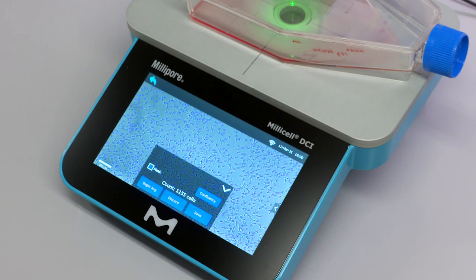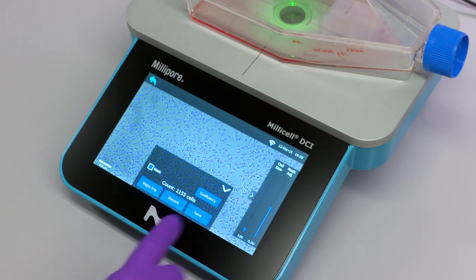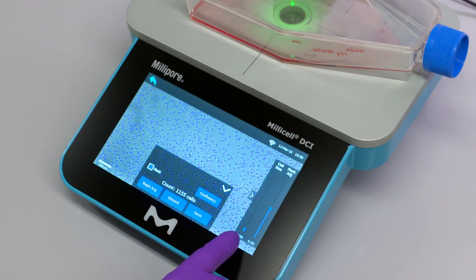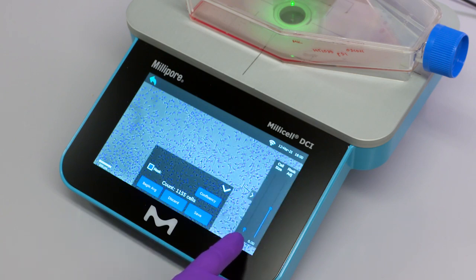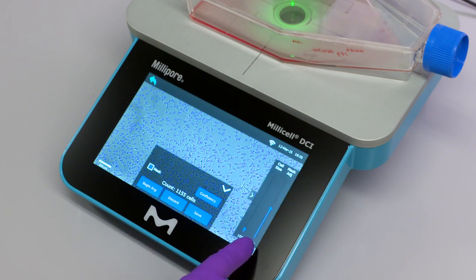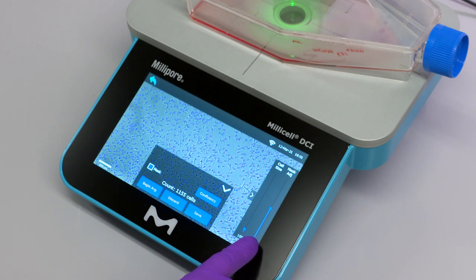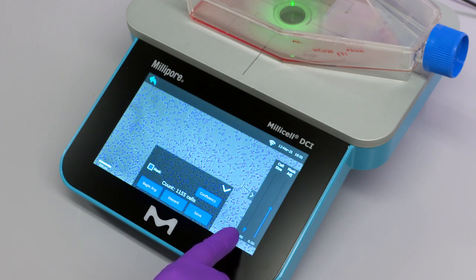The confluency and cell count masks can be adjusted using the two slide bars on the right. The mask adjust slide bar can be used to adjust the confluency mask, and the cell size slide bar will adjust the estimated cell count based on cell size.